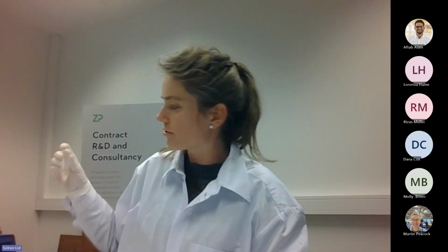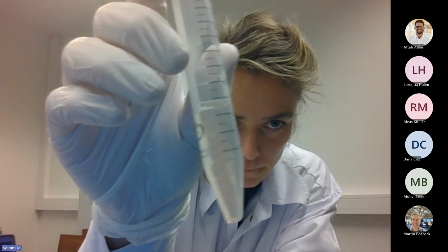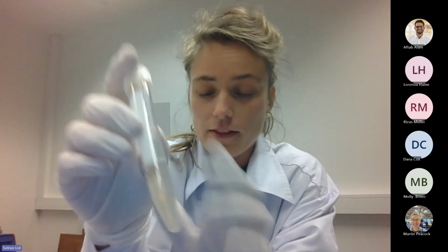And ideally, if it's a very chunky sauce, I will spend more time on the sample preparation and maybe even let it rest on the bench. But just for us to do this quick, this will be fine. So now you can see that it's more homogeneous in the sense that it's distributed around the solution, but you can still see some chunks and bits, and that is okay. The capsaicin is being extracted into the buffer phase. So if you pipette some chunks and bits onto the sensor, that is totally fine. But try to avoid the biggest chunks and bits, of course.